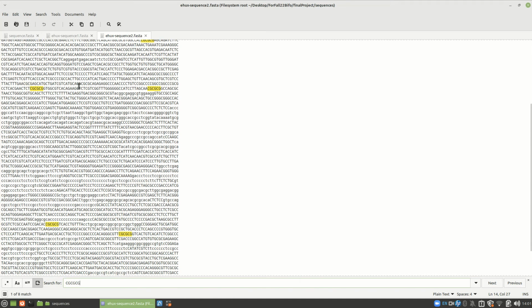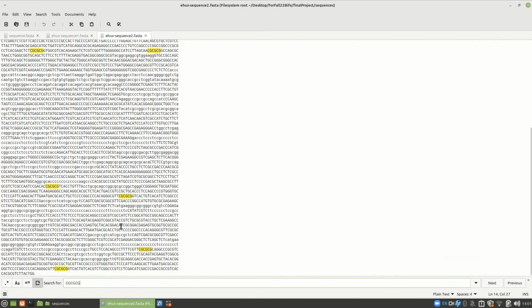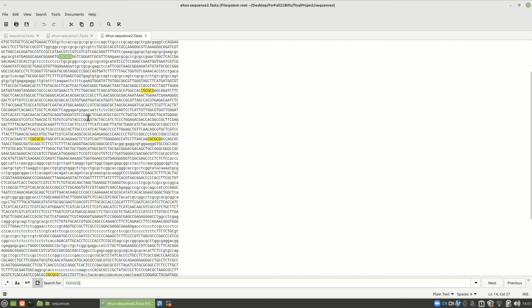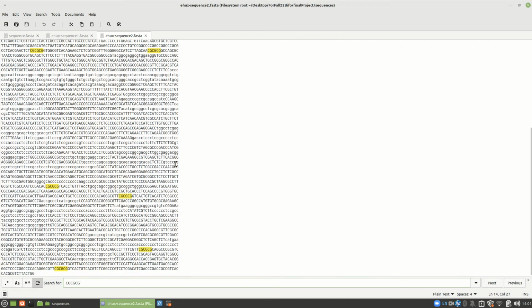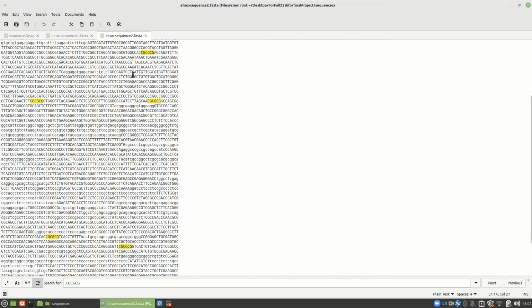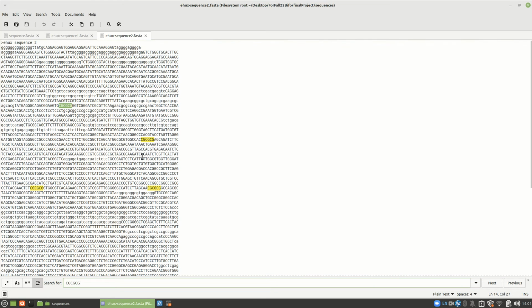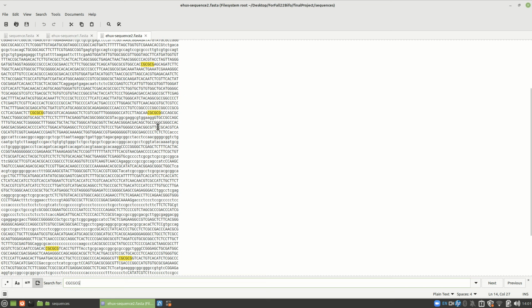And here we narrow it down a little more. So we get some CGs here at the end, but that would put our gene outside of the sequence, and I'm telling you there's a gene in here. So if we have some sequence here, I would say this is your likely promoter. And your gene is probably going to be somewhere in here. And it's a good empty space between your two CGs. So there's probably a promoter here with a gene starting after this. And this is your gene. So you would look in this region for your gene.